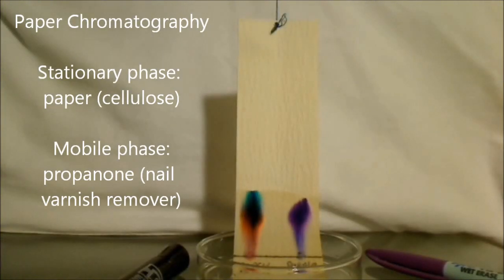The paper is the stationary phase, and the mobile phase in this case is propanone, which is nail varnish remover.